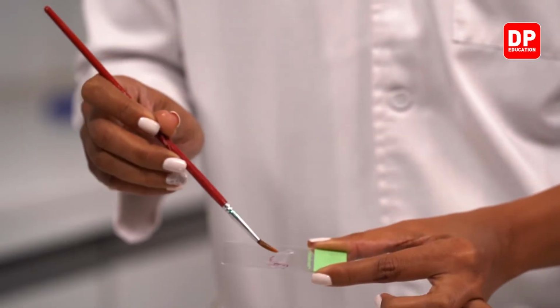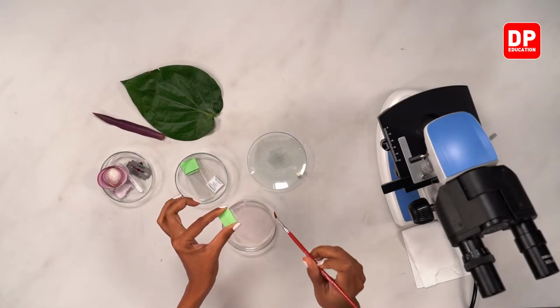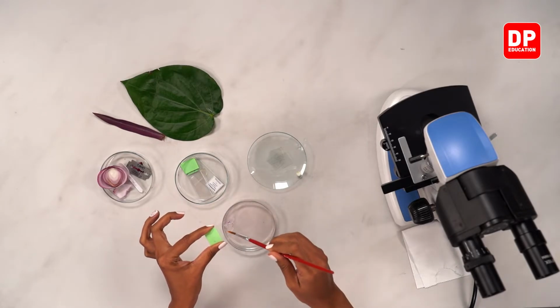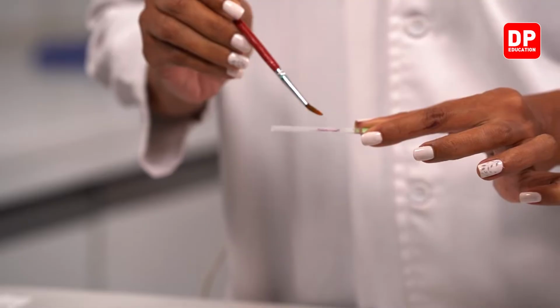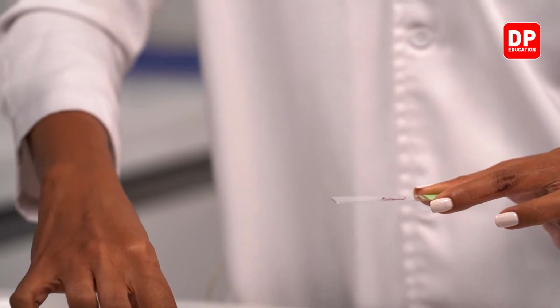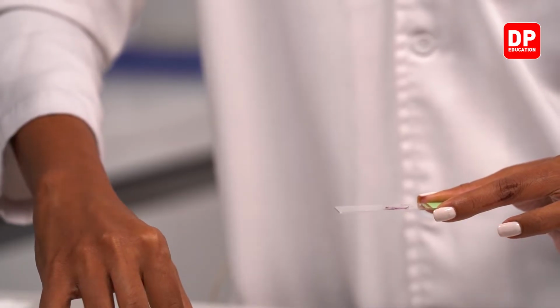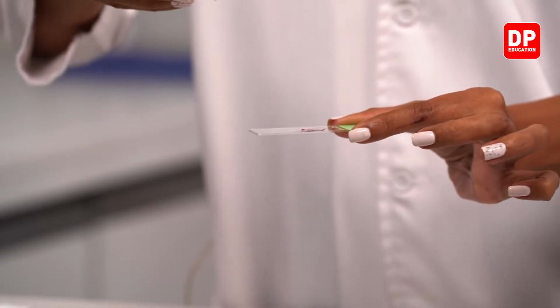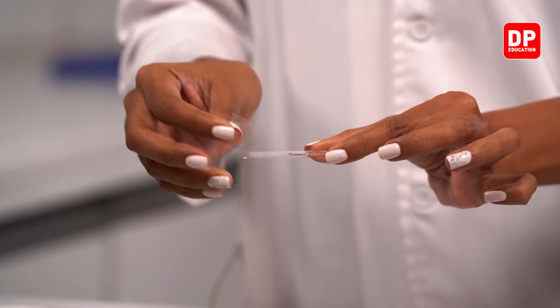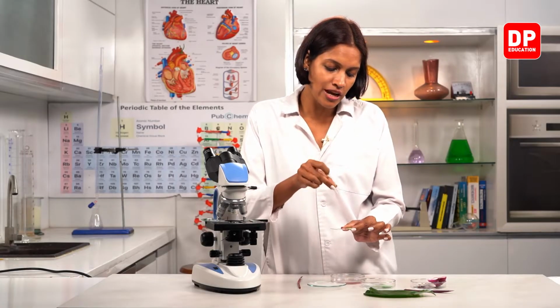Okay. So before you cover it with a cover slip, we need to put a drop of water here. In that way, the cells will not dry off and we can observe them well, right? So how to do this? You have to take a cover slip, and when we make this slide, remember children, we need to make sure that air bubbles are not trapped inside.